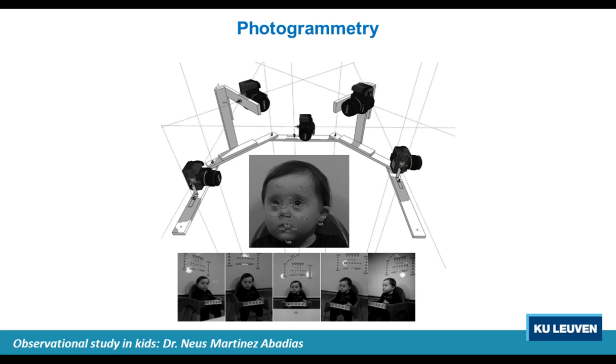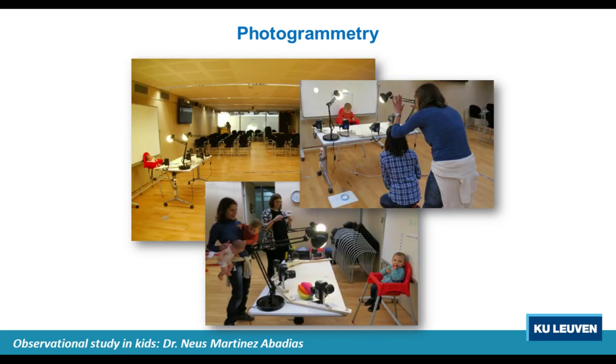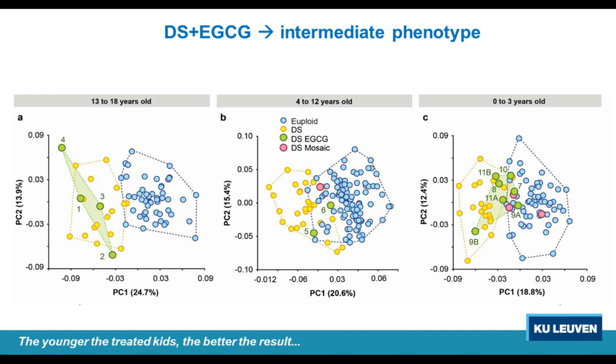And when you hear about trying to get good imaging of the faces of little kids and babies, then everything concerning CT and scanning mice is very easy. So different pictures are taken a bit like this, to give you a little bit of background on how this imaging is done in kids, to then come up with these type of results.